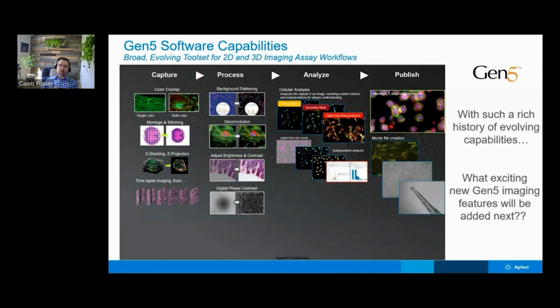That requires new tool sets that are not optimized based on fluorescent microscopy, but look at new types of assays that don't use fluorophores or fluorescent dyes. I think that's going to be one of the biggest areas that needs to grow and change to adapt to the demands of current and future research needs in microscopy.